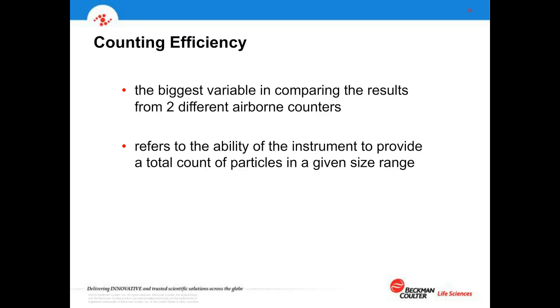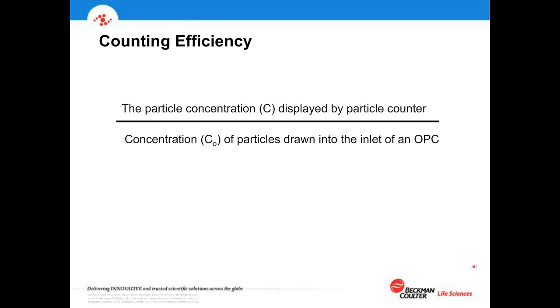And we also want to know, of course, over its lifetime that it's consistently giving us good results. Counting efficiency can help. The test is a little bit more involved, and you have to have some kind of a reference standard instrument. So this can be done on site. Many companies have instrumentation calibrated on site, but it means that the technician brings more equipment in, takes a little longer to verify counting efficiency is within the limits under 21501-4. Well, what are those limits?